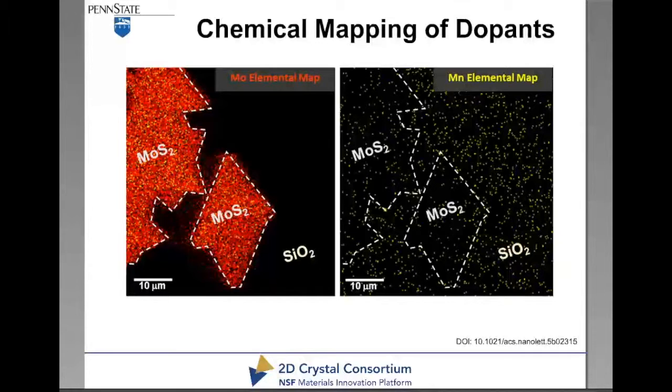You mentioned one of those graphs where you looked at characterization depth sensitivity versus spatial resolution. The question is about using techniques such as focused ion beam for sample preparation for these different systems. For the TEM, transmission electron microscopy, quite often it's done using the FIB. You come in, you slice it, and then you pull it out. It gets thinned to electron transparency, and then they use that slice in the TEM for doing cross-section.